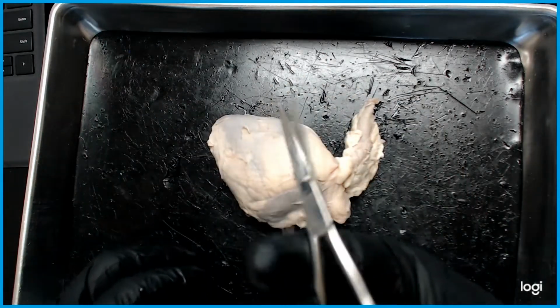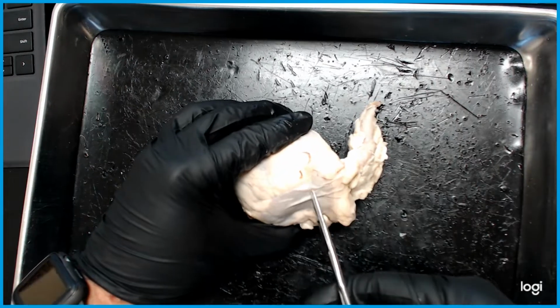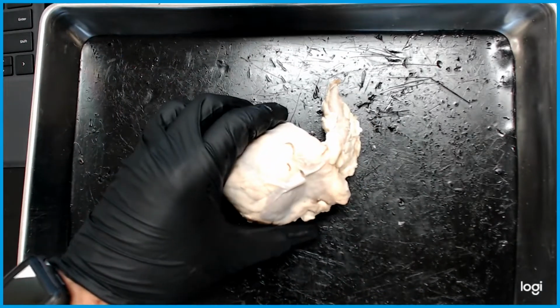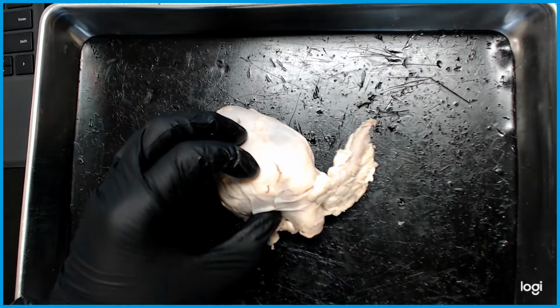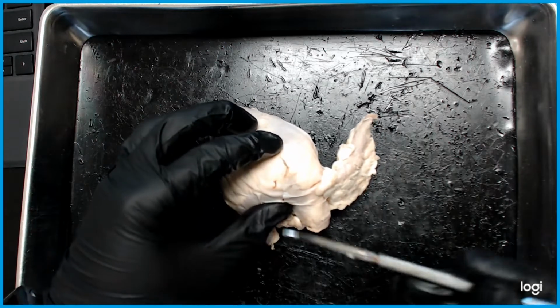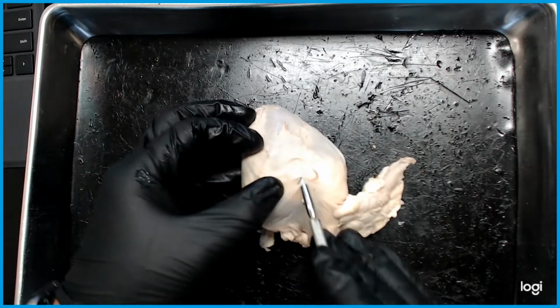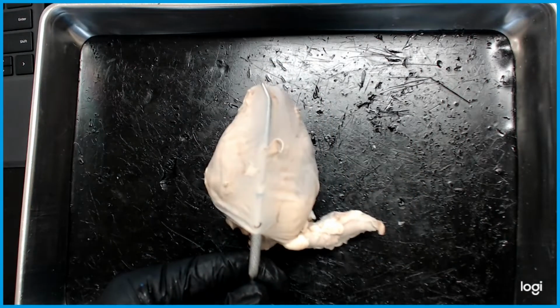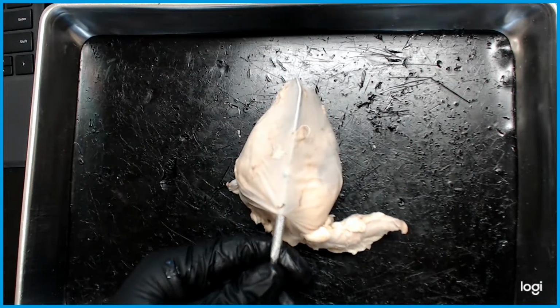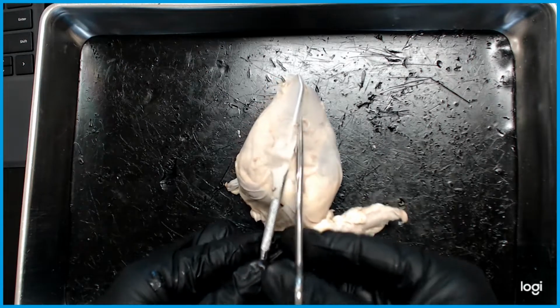We're going to use our scissors, make a small incision, and then you can use your forceps or your probe to guide you through. In this case, I'm going to be using my probe, and that's going to align everything so that I can make sure that I can cut without cutting any tissues that are further below. So let's go ahead and do that.